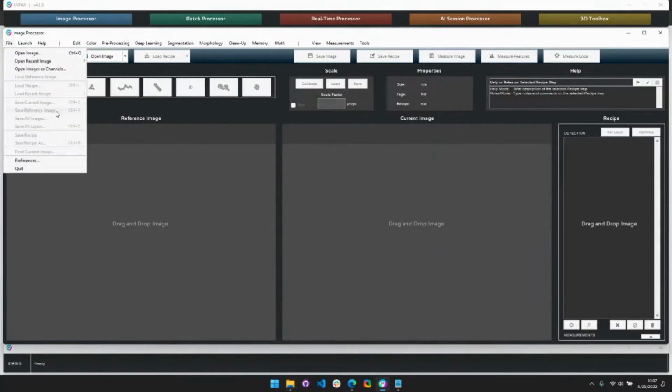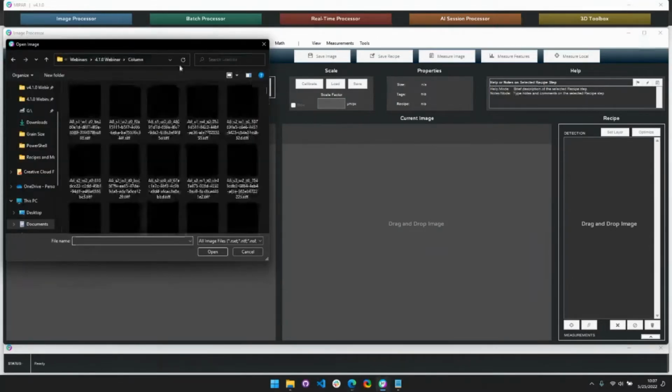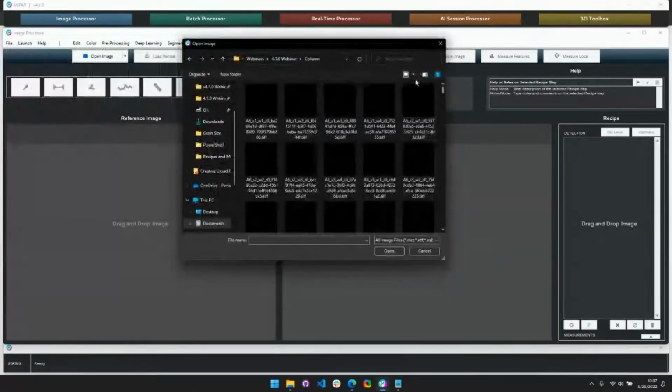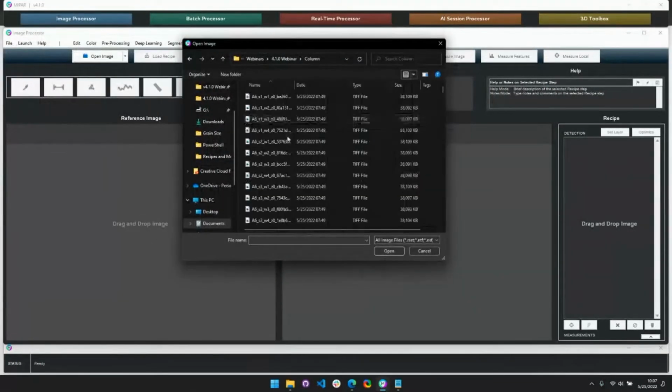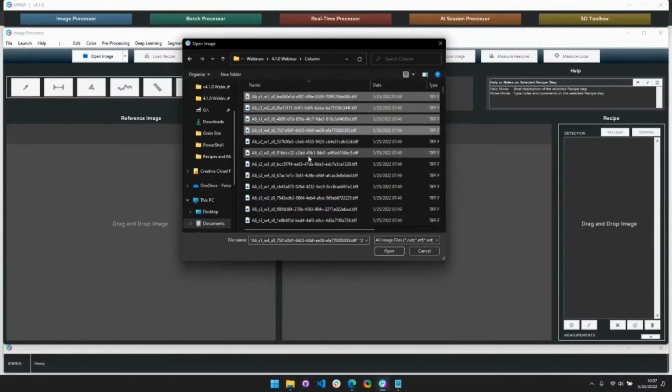So the data set that we're working with is a classic data set that comes off of a high content system, where we are collecting a well, a site in a well, and then a wavelength, and then sometimes you'll have a Z. But in this case, we have 4 channels per site, and then we have multiple sites per well. When developing algorithms, you really want to optimize for the wavelengths here. So let's go ahead and select the 4 wavelengths we would like to work on.